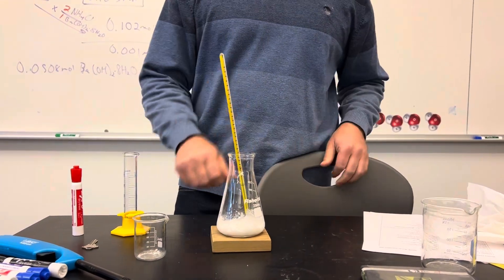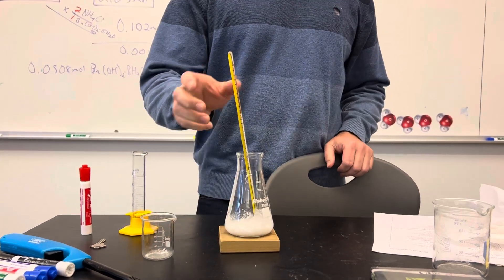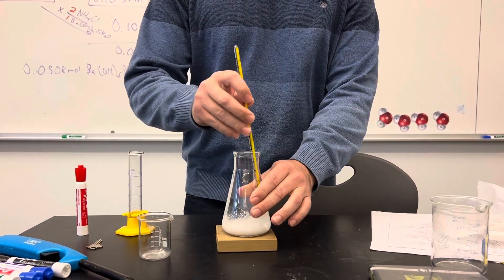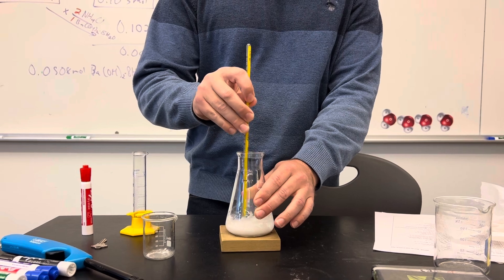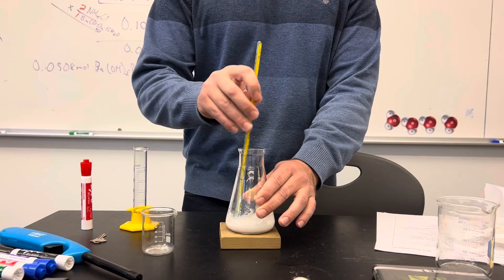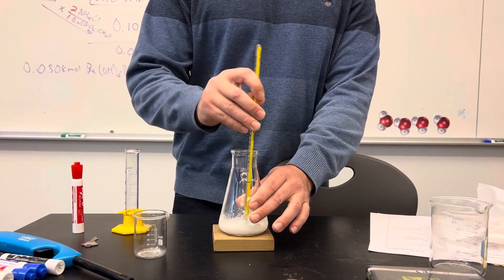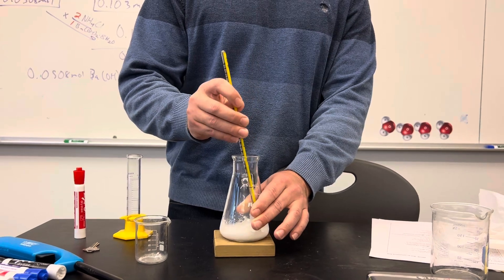In this demonstration we took some barium hydroxide octahydrate and we reacted it with ammonium chloride, two solids, one of which is a hydrate. When you react them you get a double replacement reaction where you get barium chloride and ammonium hydroxide, and you get water liberated from the crystal lattice that it was in as a hydrate.